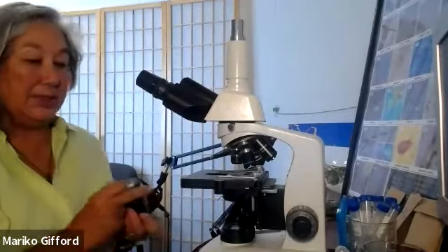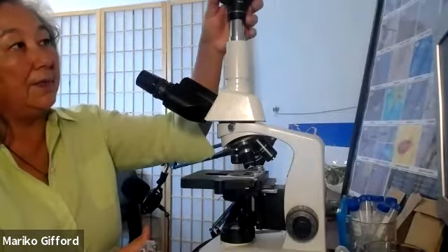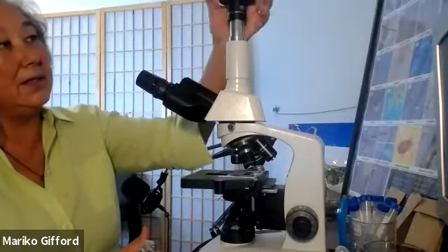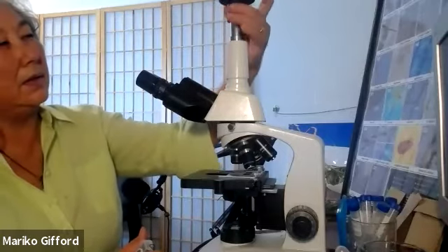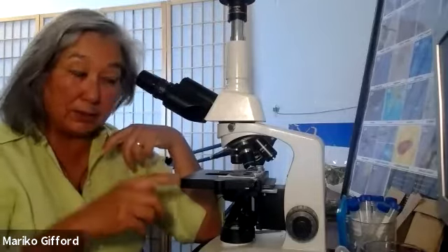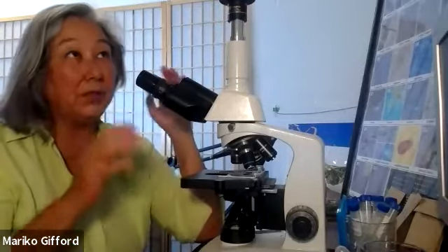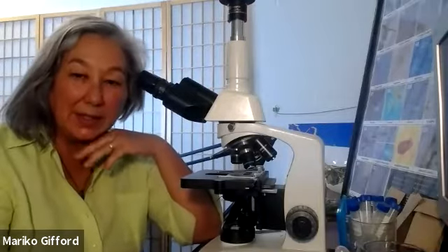So I have the ability to put a camera here, and from that camera I can connect it with a cable onto there's a cable placed on the top into my computer, and I can email images, I can show images on a projector on a wall, which we've done in classroom situations.